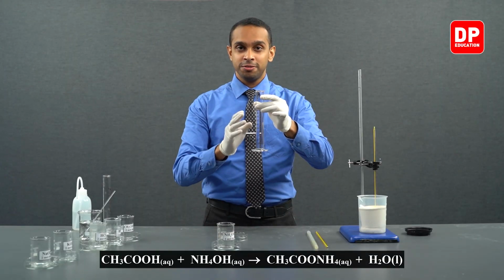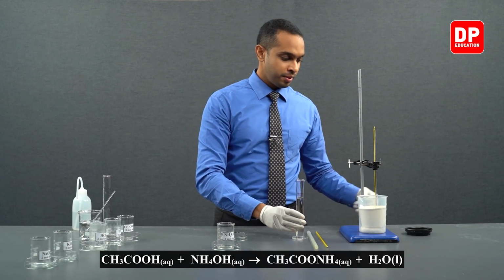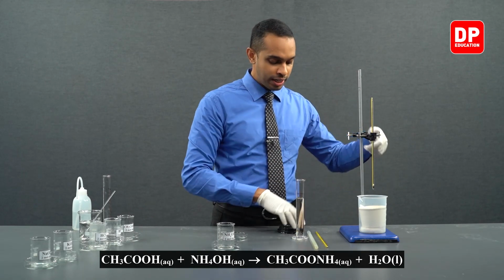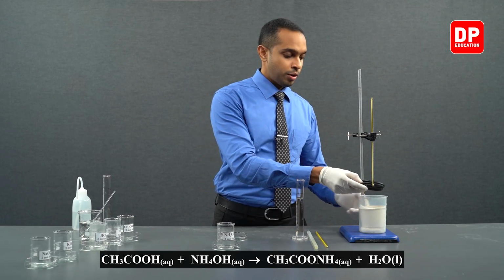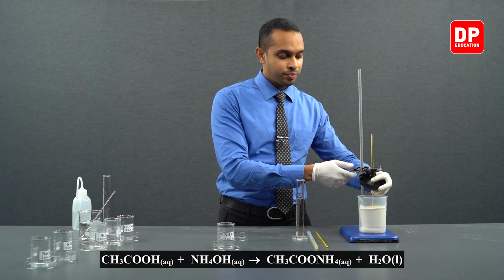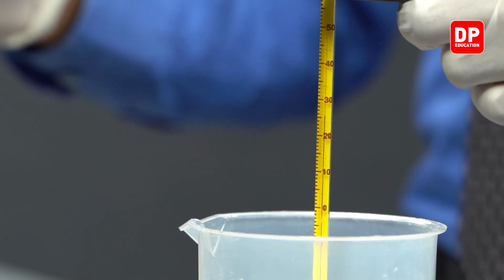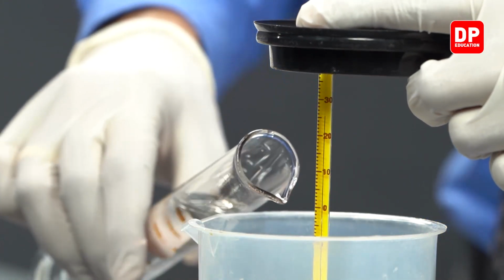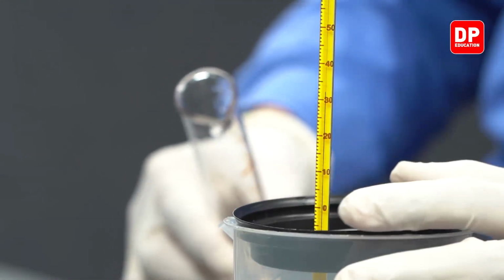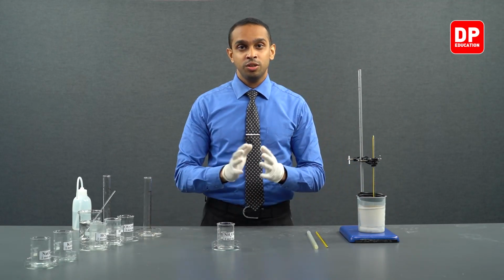We have now measured 50 milliliters of ammonium hydroxide, and we are going to add that to this plastic beaker here, which is insulated, and we are going to measure the temperature change that takes place when we add our ammonium hydroxide solution. And let's measure the highest temperature that this reaction mixture reaches.